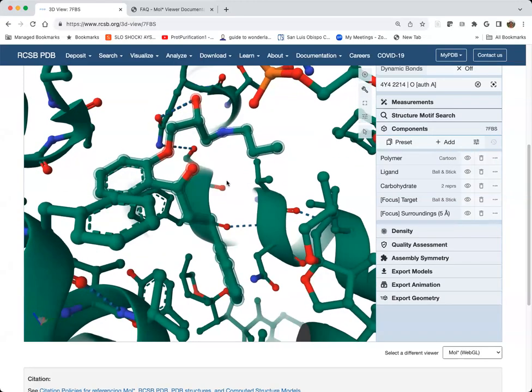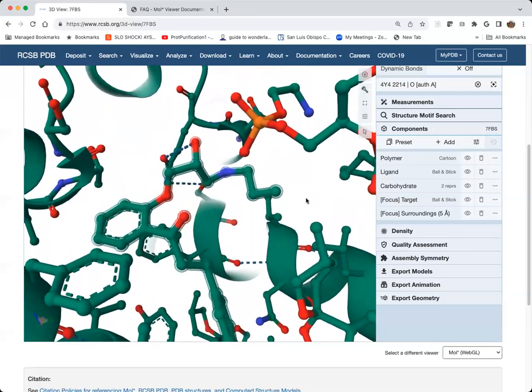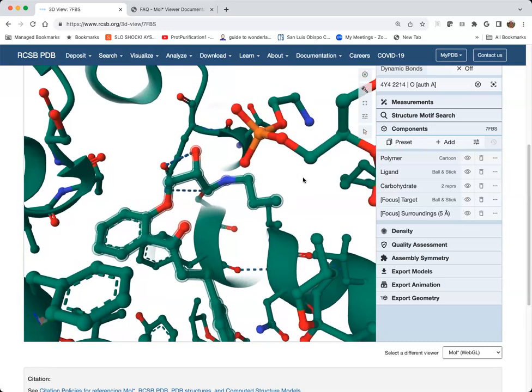But this looks really messy and hard to see anything. So there are two control boxes that we're going to use. Let me also just recenter my structure a little bit. Remember, click left mouse with the control allows me to translocate the whole structure up or down. All right, so I want to focus on this, but I want to remove extra clutter.